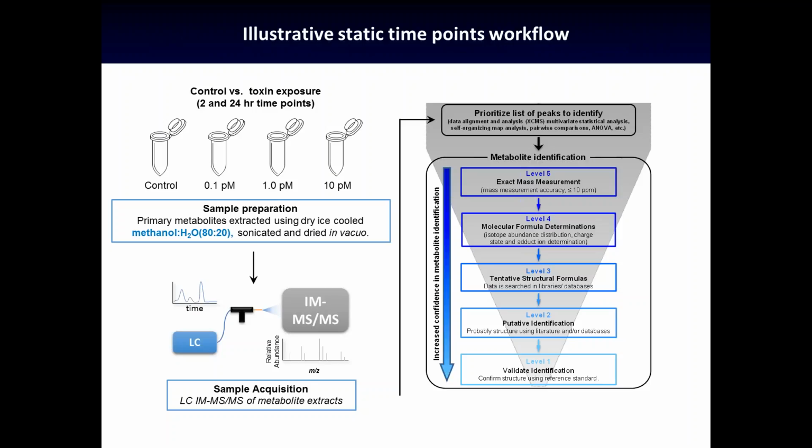Now to give a sense of what a lot of workflows look like for static time points, I'm showing some data here for a human lung cell line, A549 cells, which have been treated with a protein toxin.